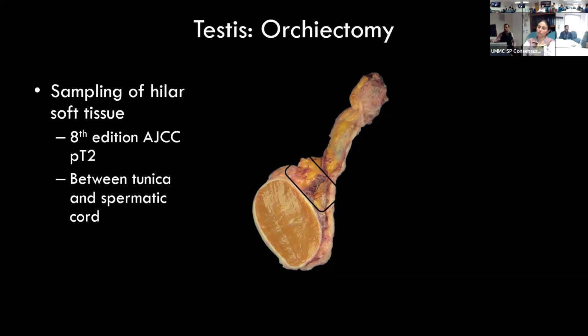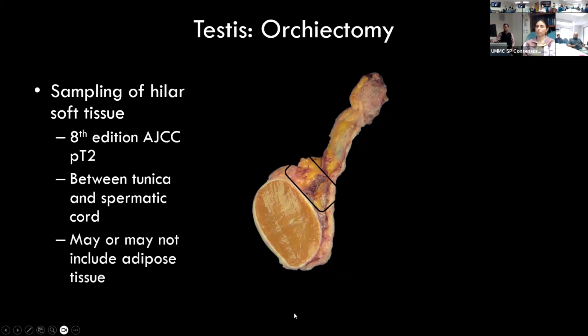Also, most sections that show you the pampiniform plexus of veins and a singular cord structure. In most of these areas, you will see the vas deferens looping around. So when you give a section, you might see multiple circles of vas. That's not spermatic cord. When you see a singular cord structure, that's probably spermatic cord. So those are the two microscopic clues that you can use. But again, like I said, gross assessment of where the spermatic cord is probably the best thing.